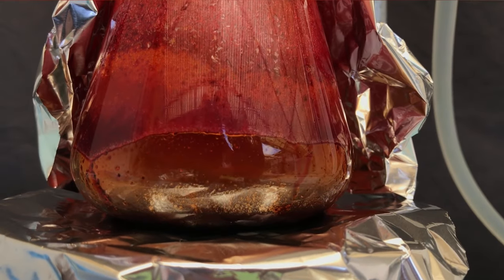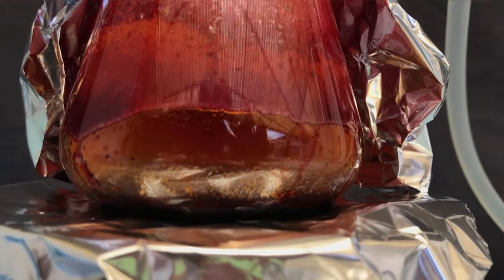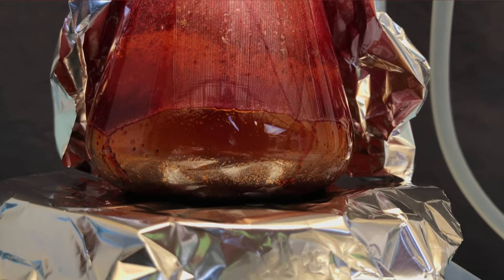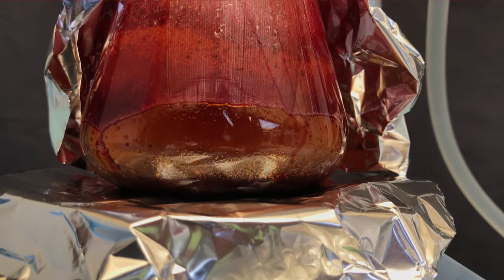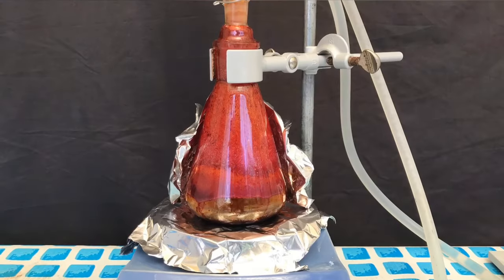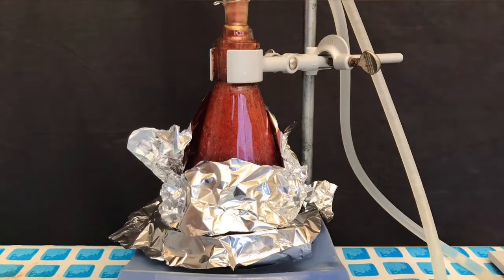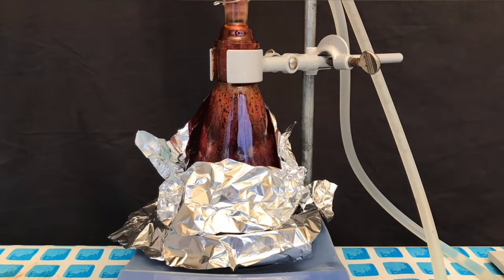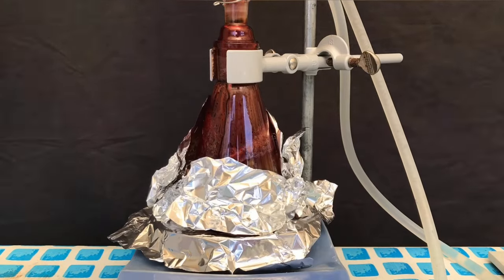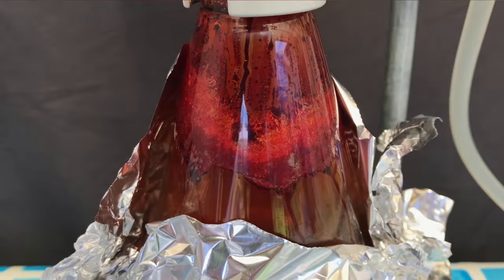Phosphorus tribromide apparently has a boiling point of around 170 degrees Celsius, but I had to crank the hot plate up to the maximum heat in order to make the vapor front climb. I don't know what's wrong with this devilish chemical.